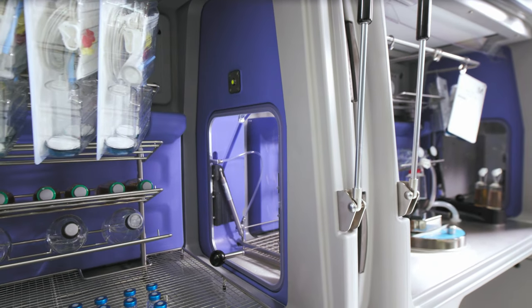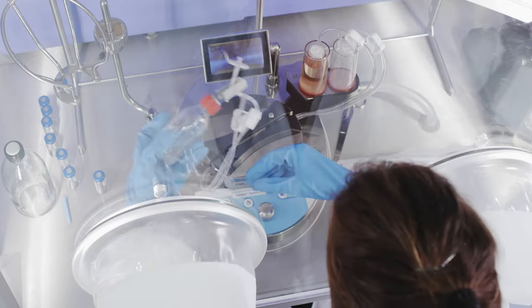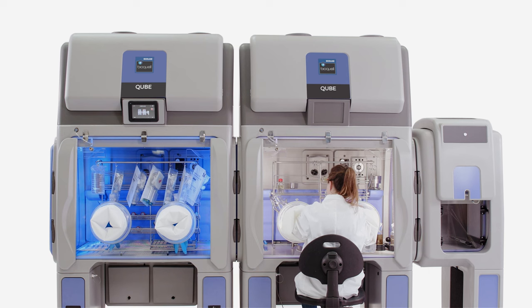With initial cycles for testing being standardized, validation is rapid. This means that you can have a fully implemented and validated system in as little as 12 weeks to 16 weeks from the initial order.